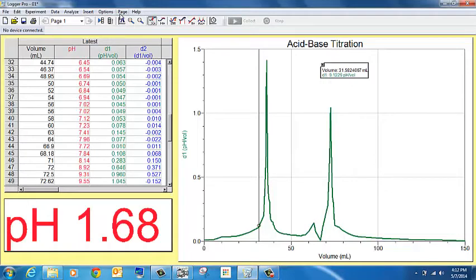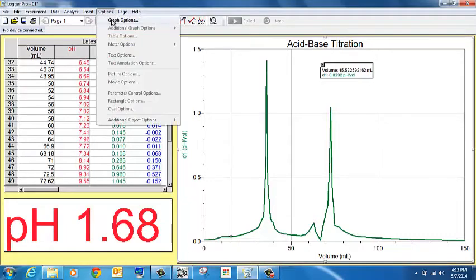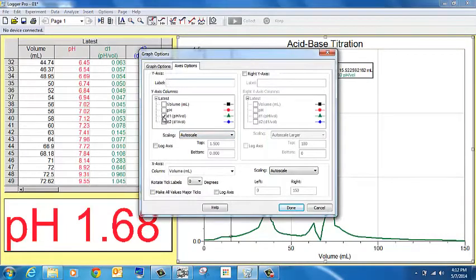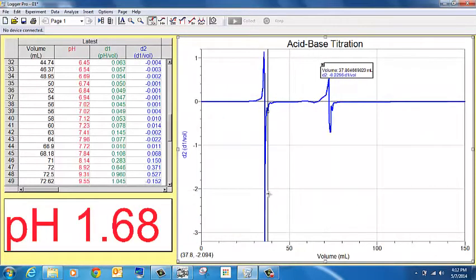All right, let's examine our second derivative now. Go back to graph options. Click on the graph, options, graph options, and instead of showing derivative one, let's show derivative two. So you can see what happens at this point where we have that inflection is there's kind of a swing up in the graph and then down right there is that inflection point. And then the second inflection point corresponding to the second point where there is an equivalence point is right there. And you can also read the volume of that same point there. So that's what first and second derivatives do for you. What you want to do in this lab is to save all three graphs and explain what all those graphs are about.